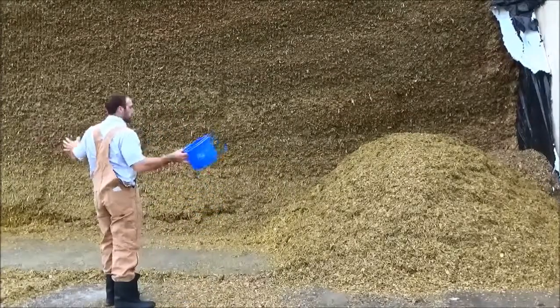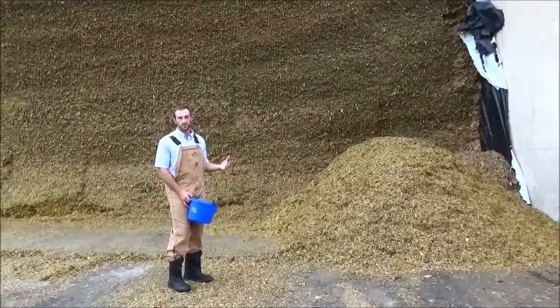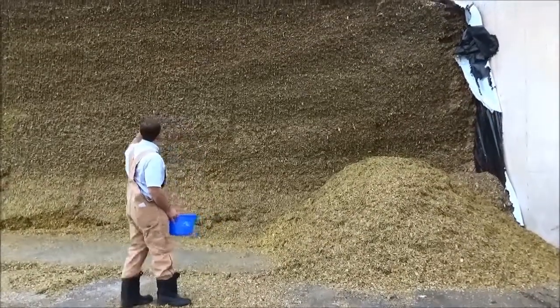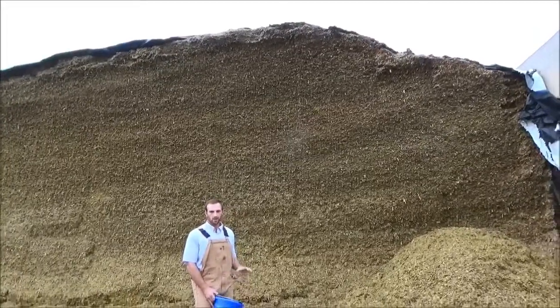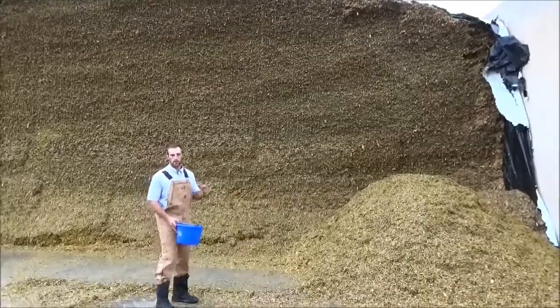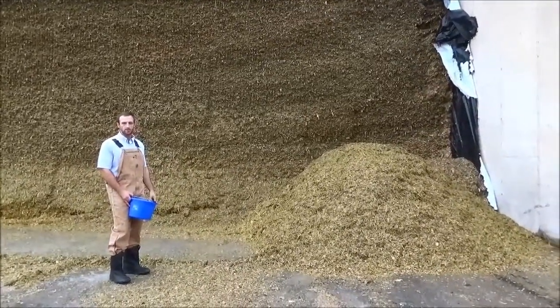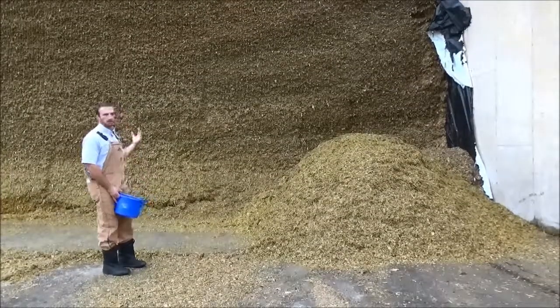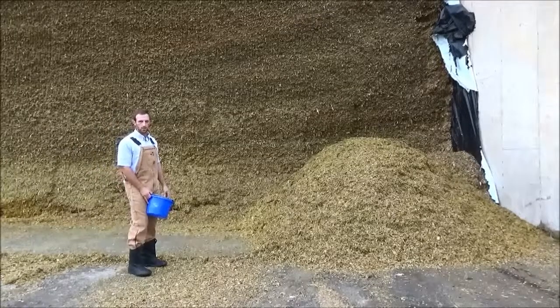Before getting started, you can see we're in front of a bunker here today. I want to stress safety as we work in front of larger feed centers and larger bunkers, pits, and piles. I'm standing a bit ways away and I've got my teammates Buffy and Jordan here as well. Only approach and enter a feed center when there are a couple of people. You don't want to approach a feed center if it's anywhere beyond 12 to maybe 15 feet in height because of safety, cave-ins, and things along those lines. We want to be cognizant of safety as we're working in and around larger bunkers and piles.